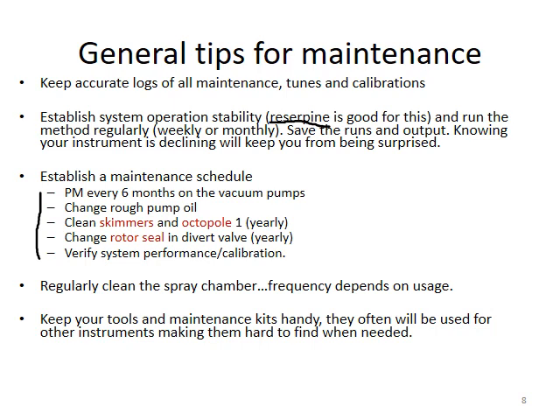Preventive maintenance, you can do it every half year, especially on the vacuum pump, because the pumps are continuously working day and night, so some preventive maintenance is required half yearly.